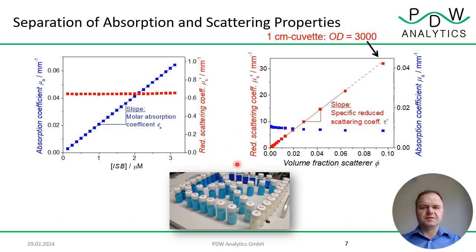With reference to this image below, on the left hand side where we increase the absorption, this is where we move across this axis, and for increasing the concentration of the scatterers, this is where we move across this axis. Well, experimentally it's possible to separate absorption and scattering.